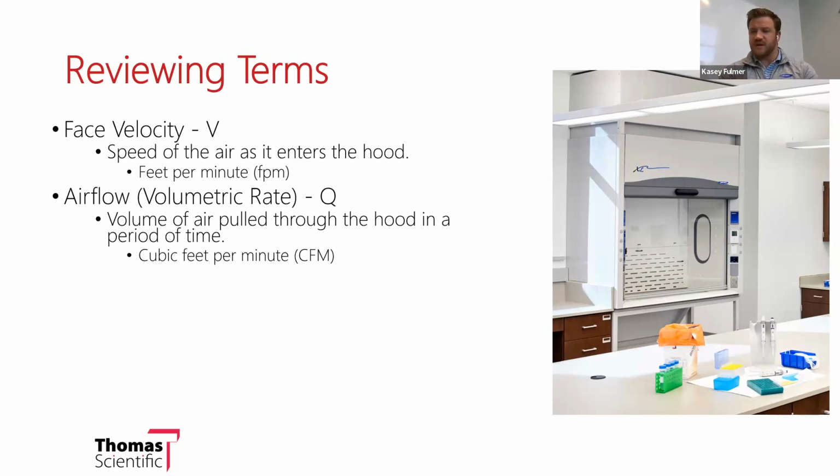So instead of being just the speed of the air, it is how much air that is moved through the hood over a period of time. It is measured in cubic feet per minute, or CFM. If you hear anybody asking, or a mechanical engineer who's requiring the airflow for their hood, well, they're talking about this volumetric rate, and they're just using that to design their buildings.